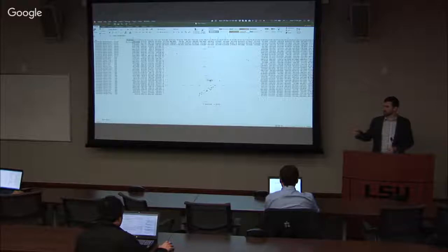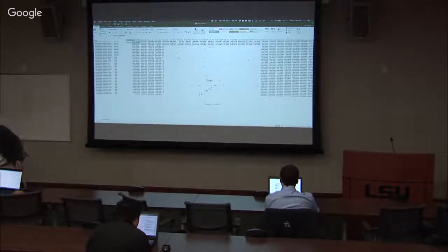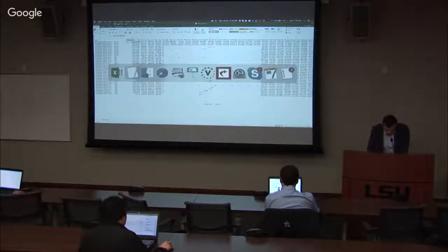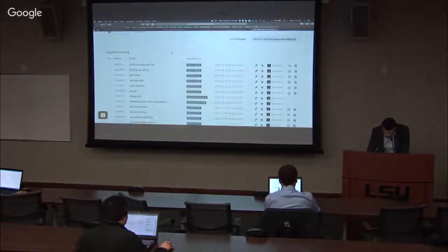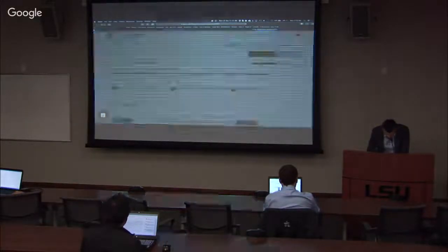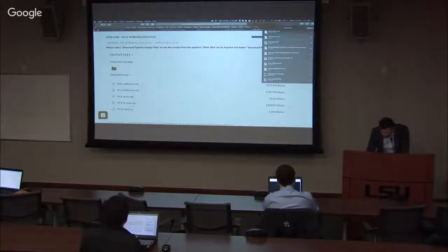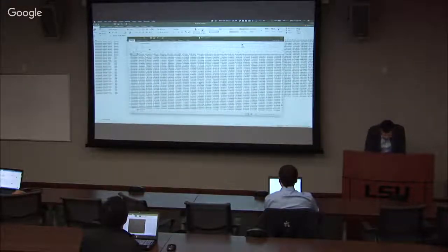Did it work for you, the quantile normalization? Okay, so now if your pipeline has already finished and you downloaded the results, I'll just go to my pipelines, and then I have PCA, normalized PCA, what I called it. And let's just download the table right away. So, opening it in Excel.